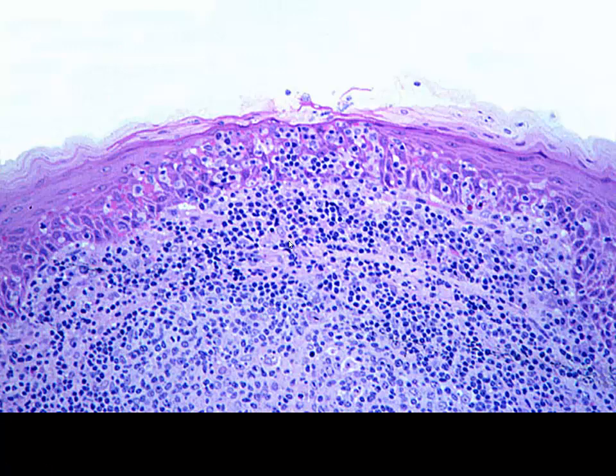And again, the epithelium we're going to see on the free surface is stratified squamous, non-keratinized, and I know this looks a little bit keratinized here, but we do see some nuclei out here. And we're also potentially going to see these lymphocytes infiltrating into the epithelium itself in some of these areas of our tonsils.